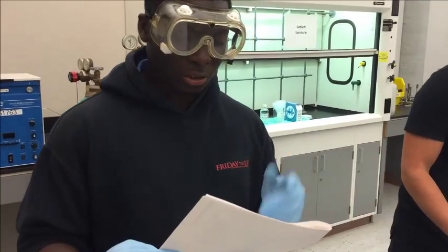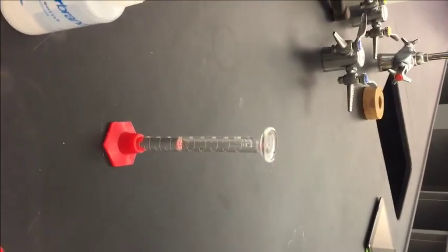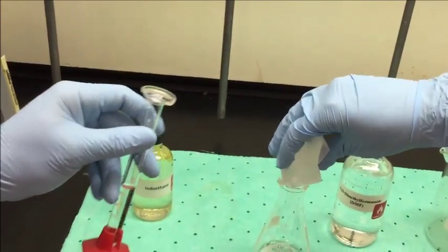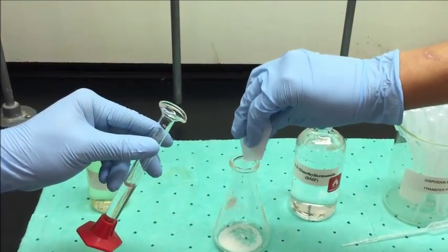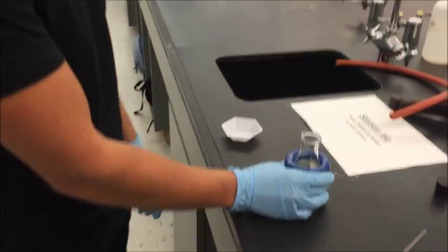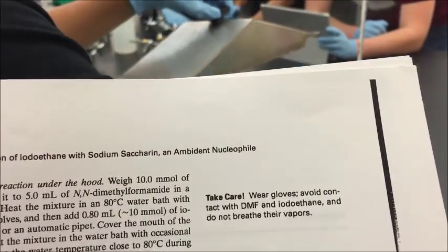We start by carrying out the reaction under the hood. We weigh out 10 millimoles of sodium saccharin and add 5 ml of DMF into a 125 ml Erlenmeyer flask. We take the mixture and heat it in an 80 degrees Celsius water bath with swirling until the solid has dissolved. Then we add 0.80 ml of iodoethane using a dispenser or automatic pipette.